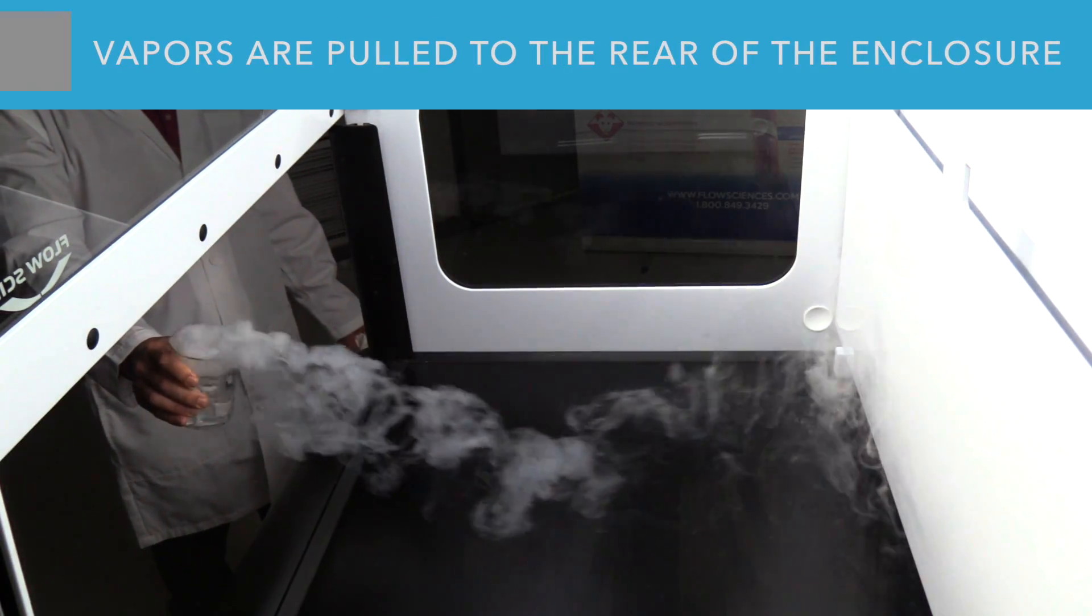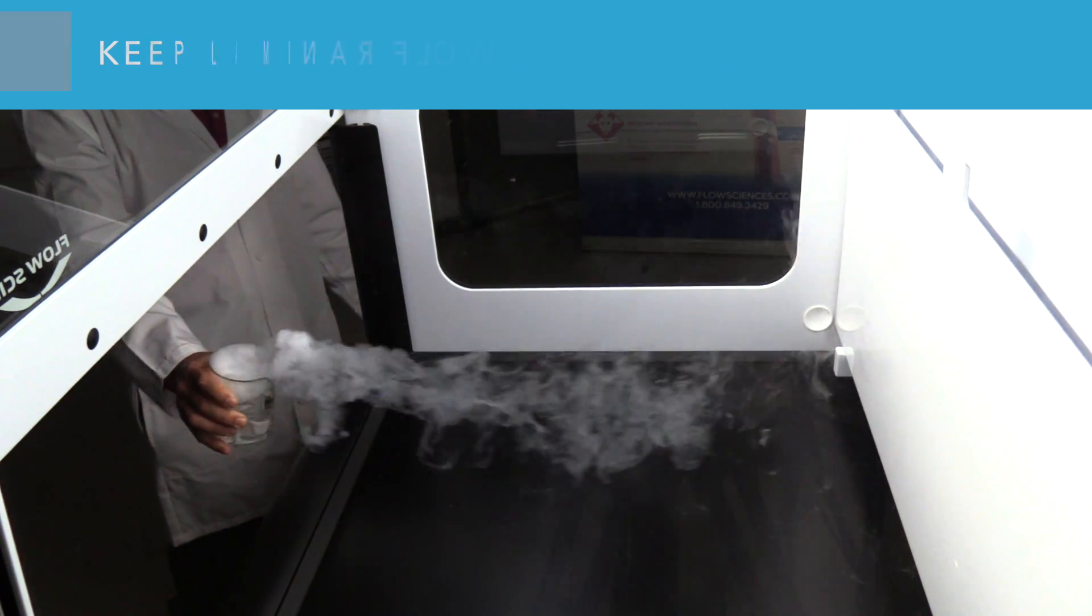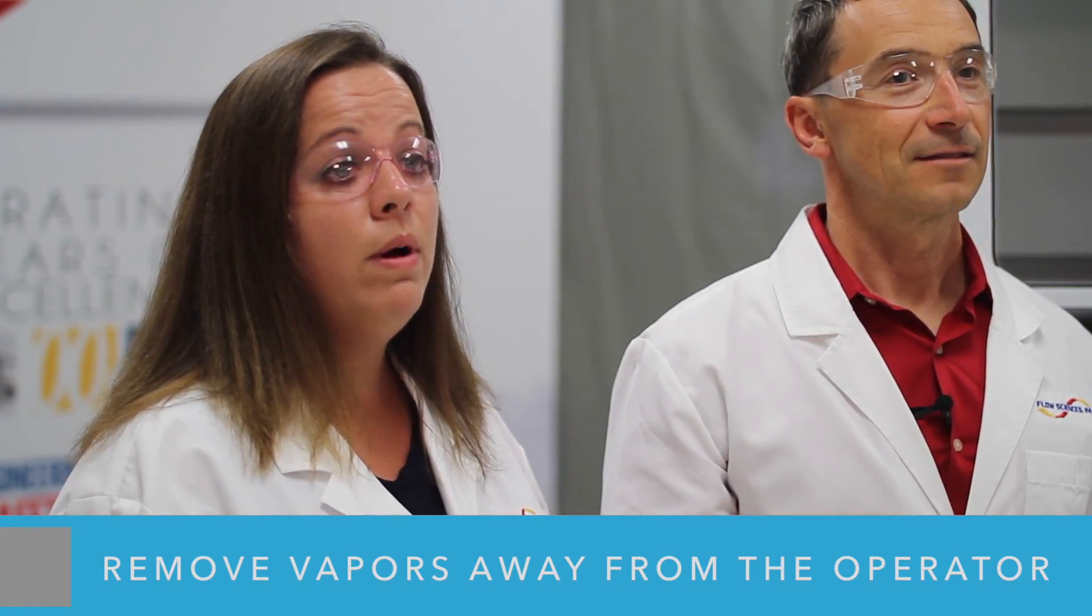Vapors are pulled to the rear of the enclosure, then up through the plenum to keep laminar flow across the work surface and remove vapors away from the operator.